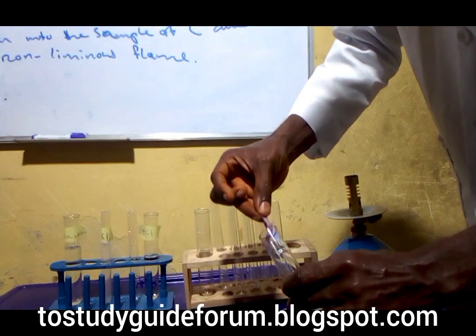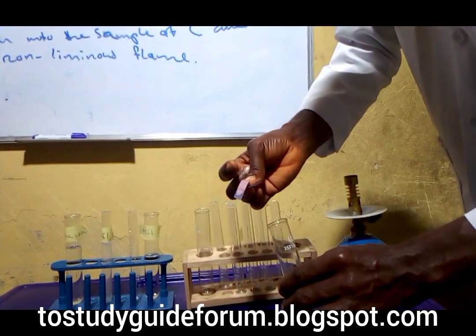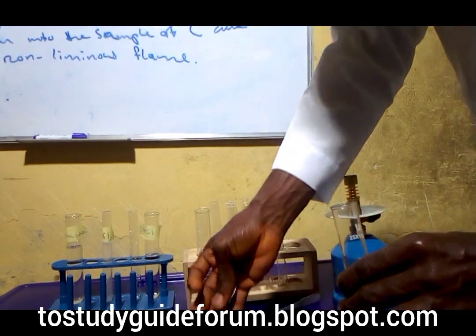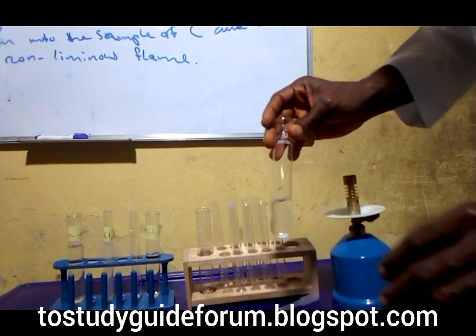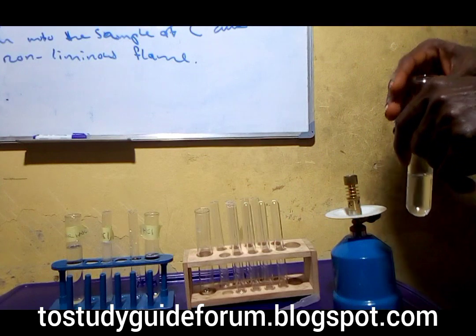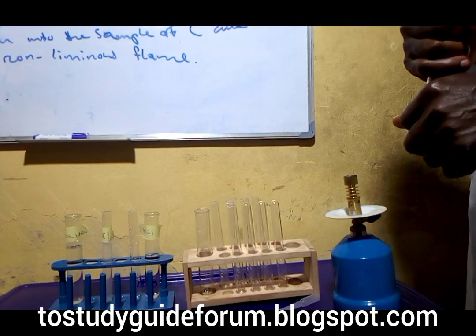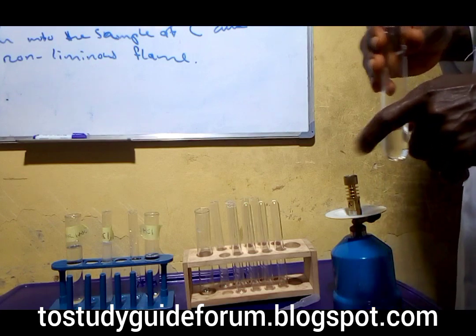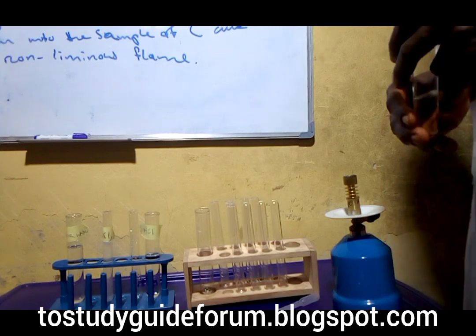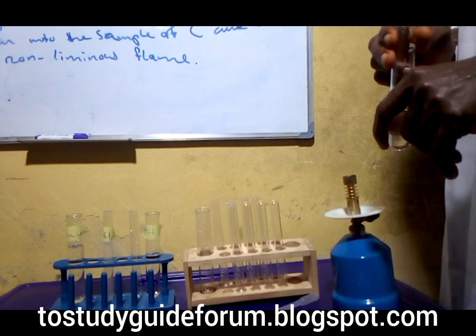Okay, that means it turns red litmus paper blue, meaning that the compound here is alkaline. Since it's alkaline, hydrogen trioxocarbonate is likely to be absent. That means potassium, sodium, and ammonium salts are likely to be here.